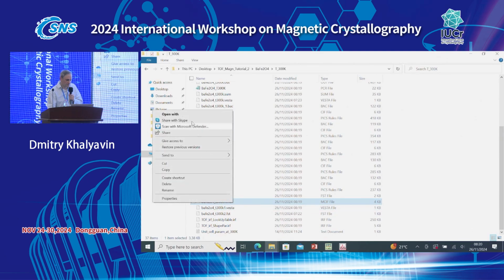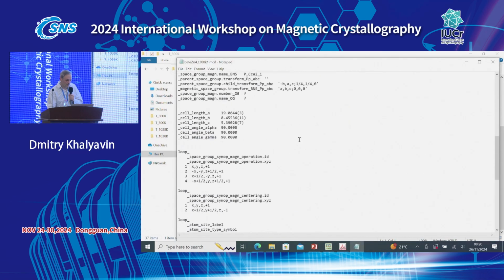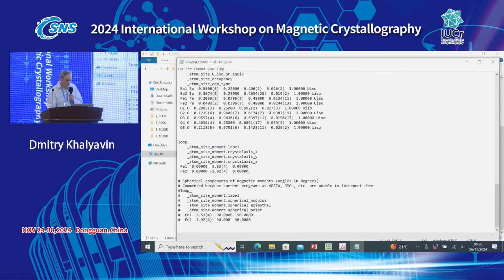Again, let's have a look at the MC file. So 16, yes, it's probably, no, 2 sigma, yes, probably not. So as a final refinement, you see, the difference is roughly 4. We can keep, yes, we can keep the final refinement like that. We can keep them independent.